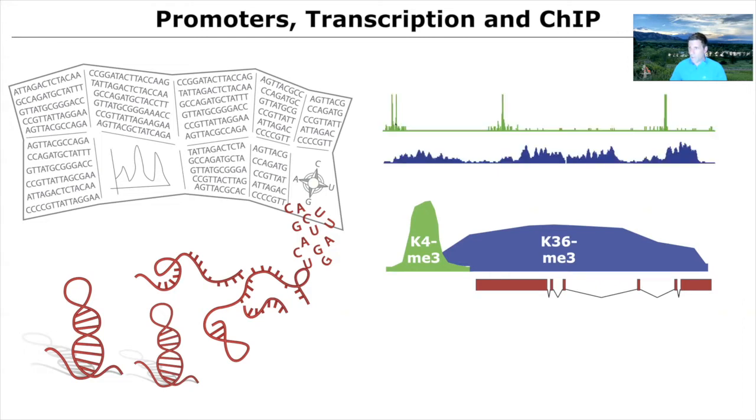So what we're going to see is tracks that look more like this. Nextflow's already produced them for you, and we're going to go look at those in visual browsers in the next class. But for now, there's some data shown here where you can see a promoter and then the transcribed region, promoter, transcribed region. So you can almost see where the genes are just by these two DNA binding proteins, which actually are the packaging histones of DNA. And we're going to look at dozens of DNA binding proteins that might be binding in this region to regulate this gene.